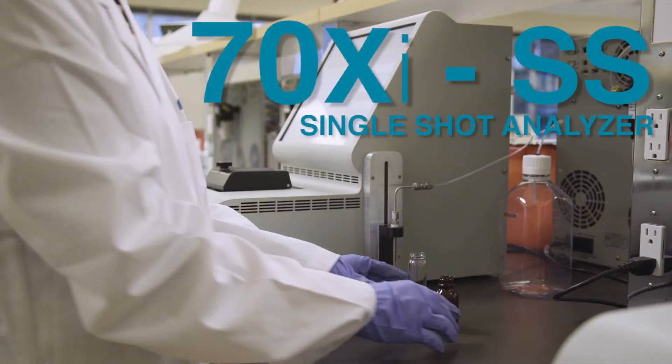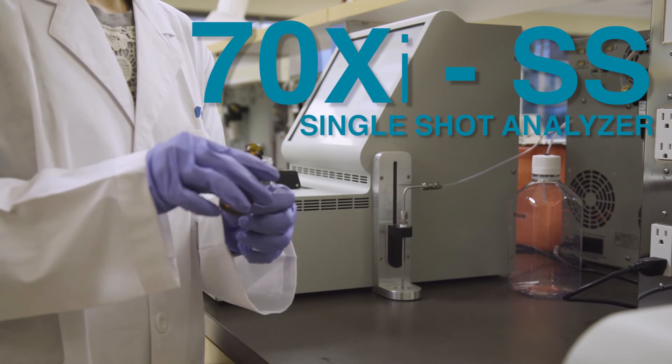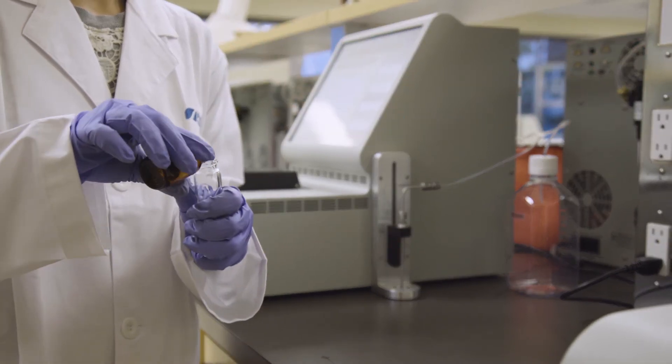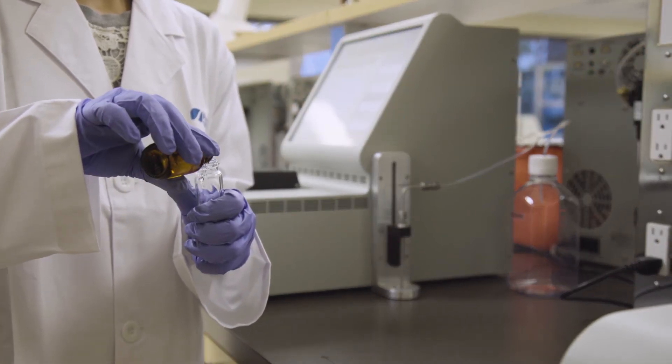The Single Shot 70 XI Analyzer features automatic sample loading through a sample injection port and solvent-free self-cleaning.